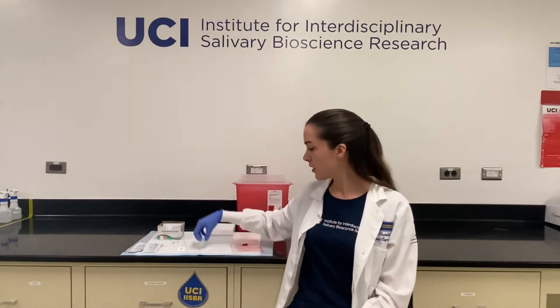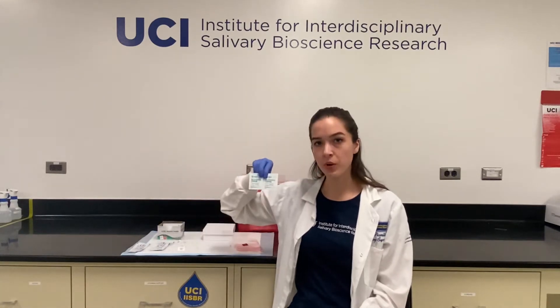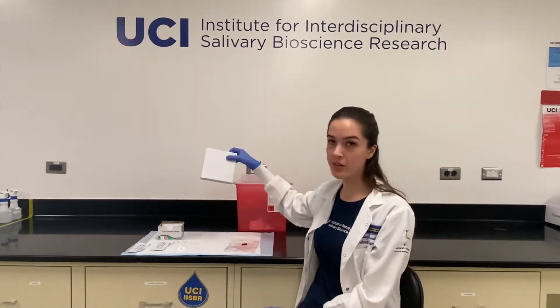You will need a few items for your passive drool collection including a collection tube, a saliva collection aid or a straw depending on what you were given, an alcohol swab to wipe your tube down with, water to rinse your mouth out with, and a container to put your sample into while it's stored in the freezer, such as a plastic bag or a box.